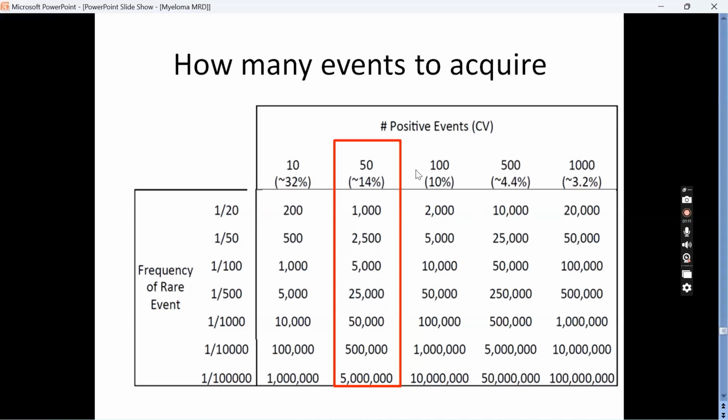So this 10, 50, 100 is something called limit of detection or limit of quantification, which I'll tell you now. But still, just remember this. One thing, if you observe, as the number of events which you need to call it as disease, or the criteria which you set up to call it as disease, increases, the CV decreases. That means it is more reproducible. It is more precise.